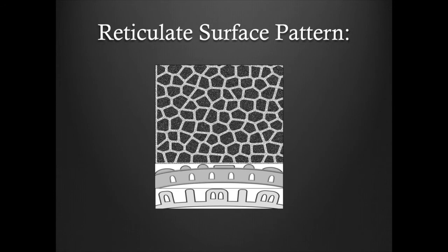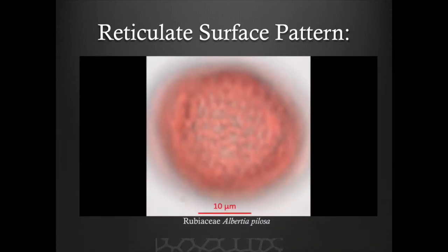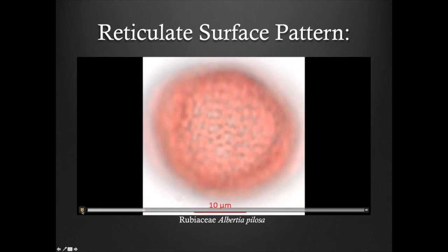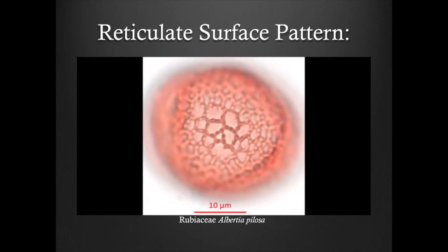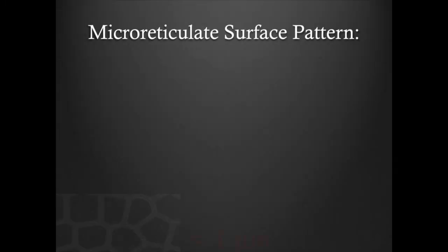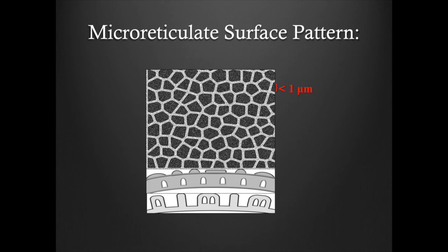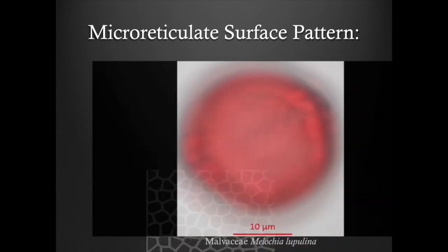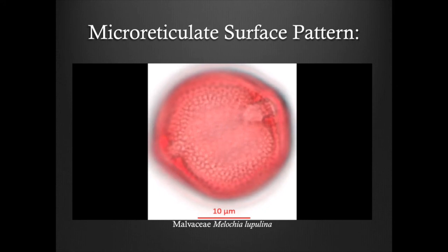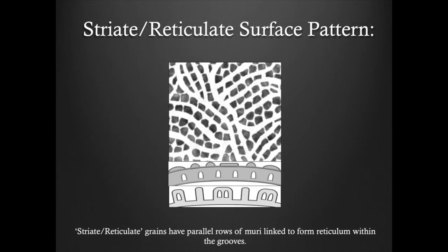Here is an example of a reticulate grain. Here is an example of a micro-reticulate grain. Striate-reticulate grains have parallel rows of muri linked together to form reticulum within the grooves.